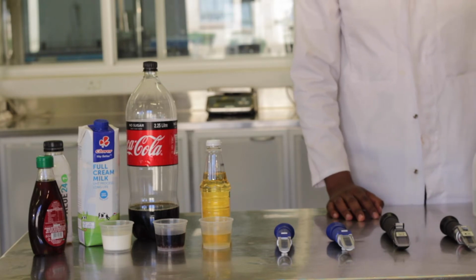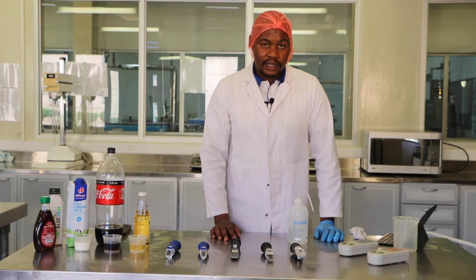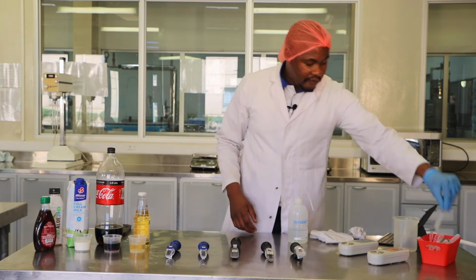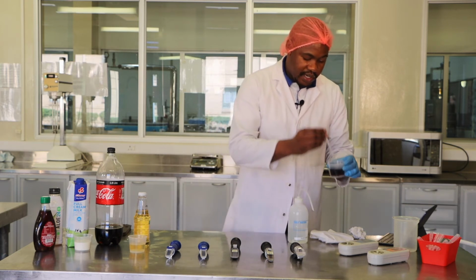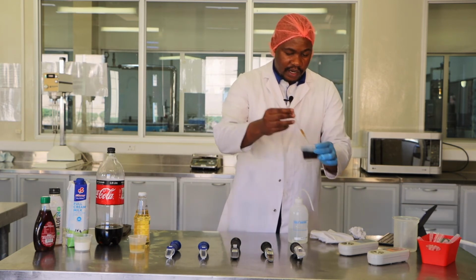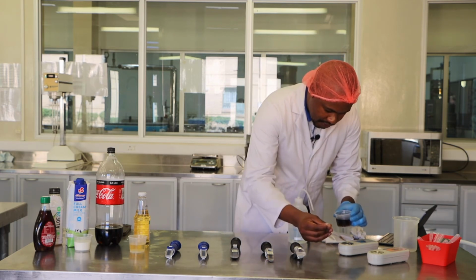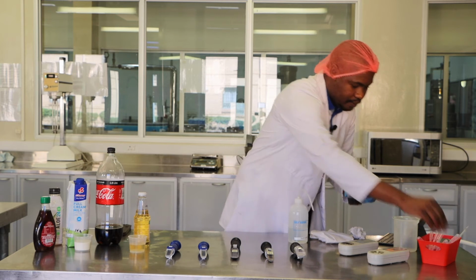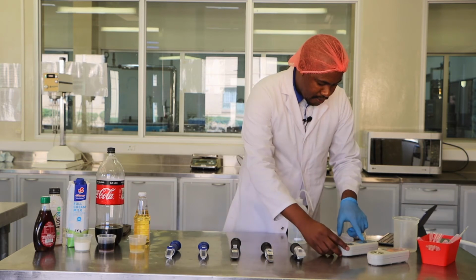So once you have established that your refractometer is calibrated, it gives you a 0 reading with distilled water, then you can begin the analysis. Now I'm going to measure the concentration of, for example, Coca-Cola, to see how much sugar is present. I'm going to use a Pasteur pipette, put just a few drops to cover the whole surface, keep this over here, and then I say measure.